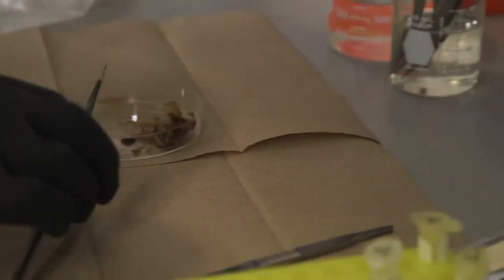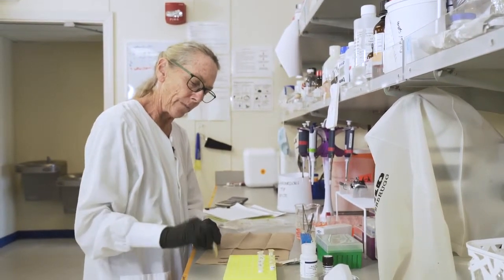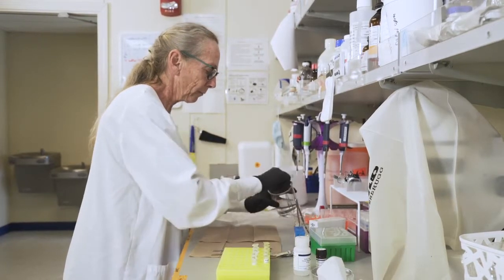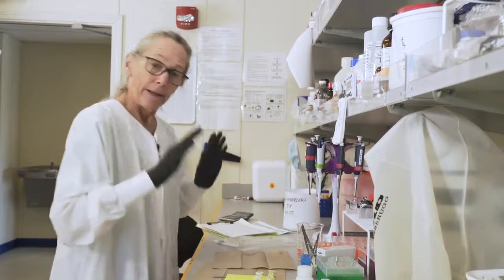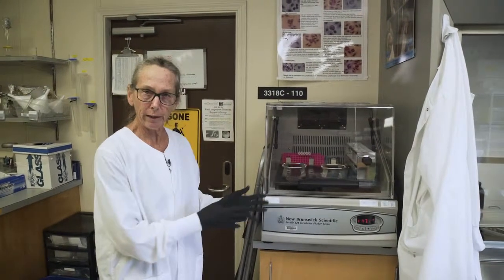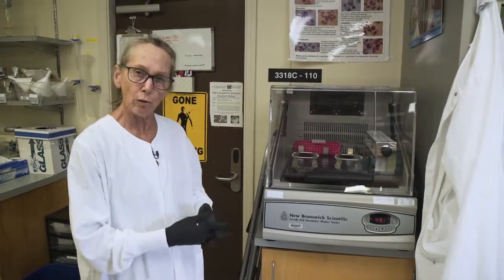We clean up and put the organism back in the bag, then put our tools back in the bleach — the bleach water will destroy any DNA. Make sure everything is down in the lysis buffer by tapping and pushing the tissue down. Because both pieces are from the same organism, we don't need to rinse the forceps in between. That completes the tissue extraction. From here we move on to the digest: we've added enzymes that will lyse the cells and break them open to release the DNA. The tubes go into the incubator overnight with a gentle rocking motion, and the tissue will digest, leaving it ready for the DNA extraction step.